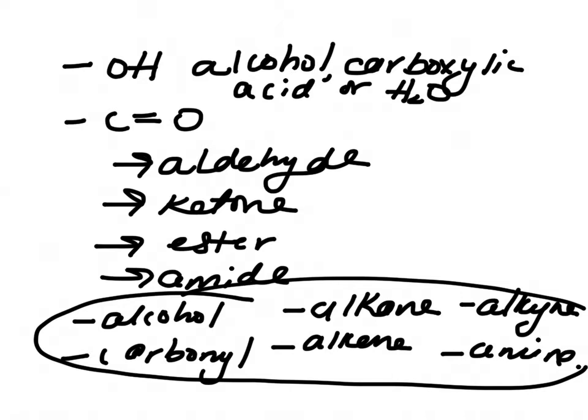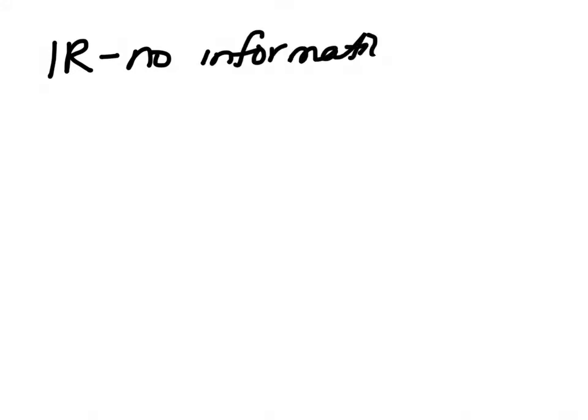But if you recall, from IR, there was no information about the connectivity.